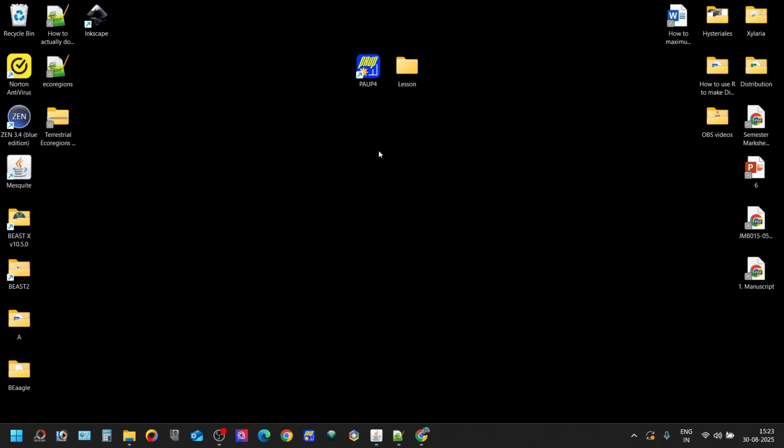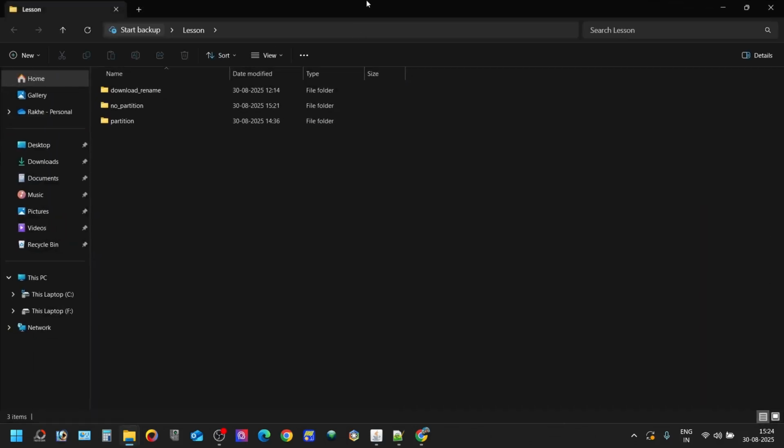The first one is heuristic search, which will produce a tree with branch length but no node supports. Bootstrap resampling will produce a cladogram without any branch length but with bootstrap support for the nodes. So we're going to use these two trees to generate the final tree that will be used in your paper or whatever you want to use it for. So let's get started with the first analysis.